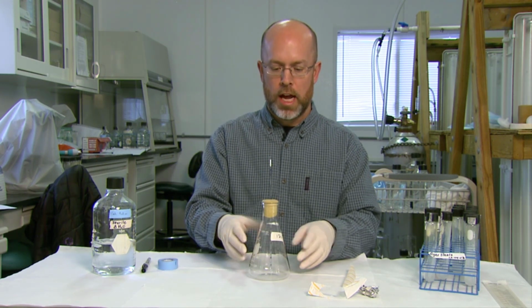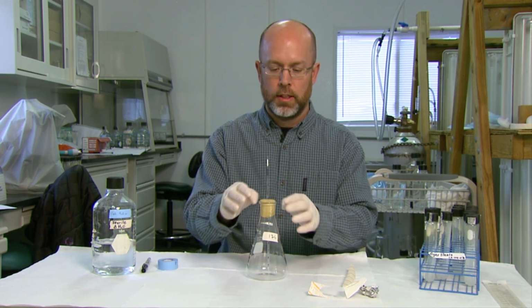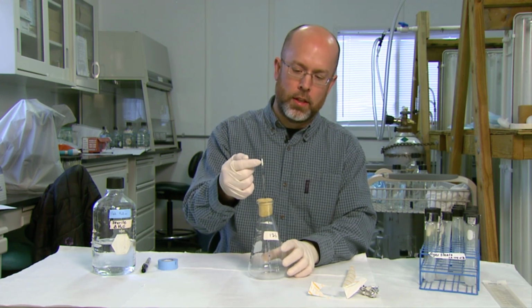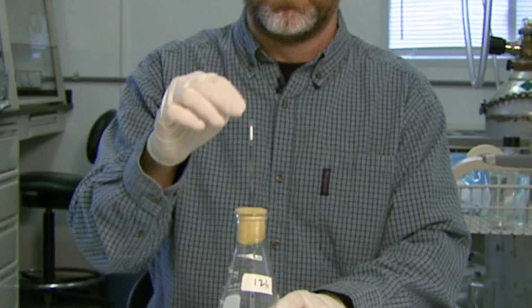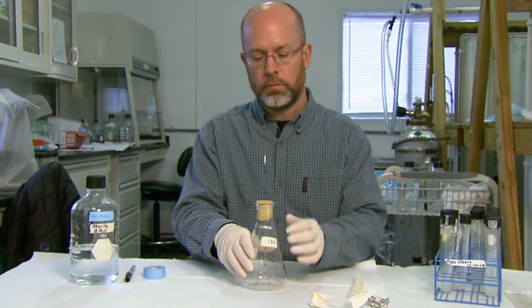Okay, so now you have your flask, your culture container, which in this case is a flask, your foam stopper to prevent air from getting in, and your bubbling tube. You'll notice too that the bubbling tube, or in this case a pipette, has a little piece of cotton in the end. That also provides some filter for the air that's going to be coming in.